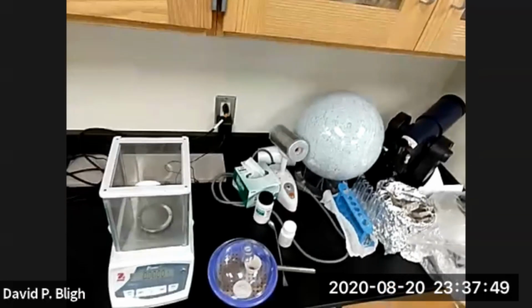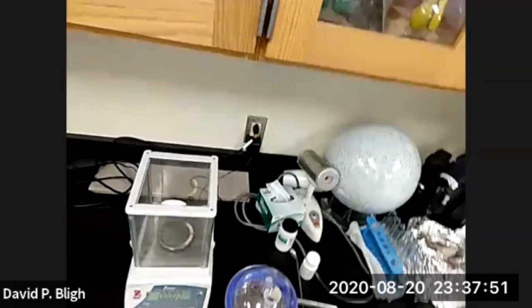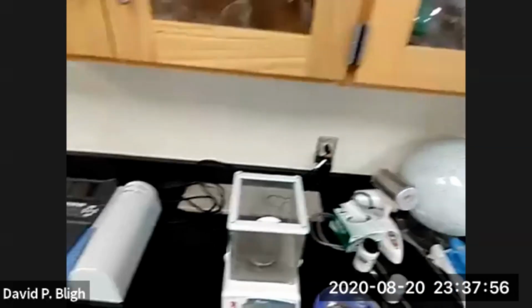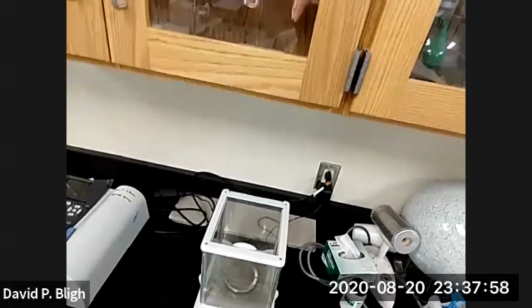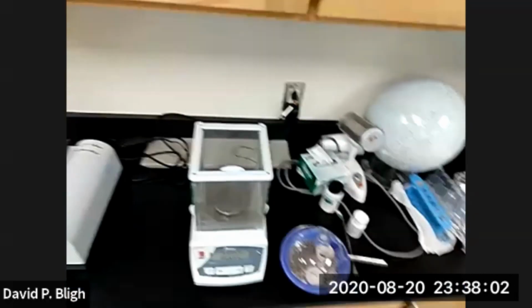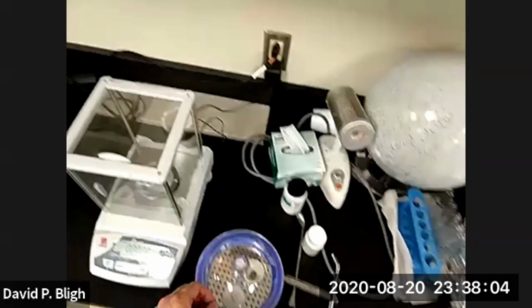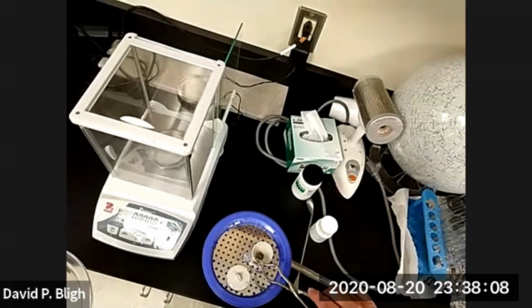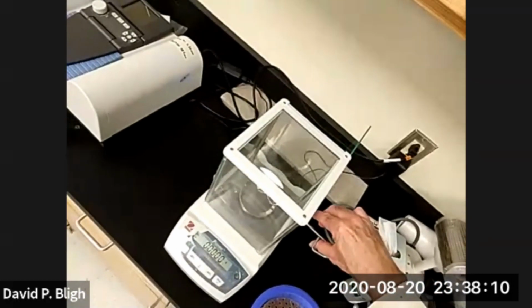And what that will do is deposit some of the material on the lid. So if it does that and you don't have the lid weight, then you've lost material that you think is water, but it really isn't. So you weigh both of them. And that is the value, the weight of your crucible.